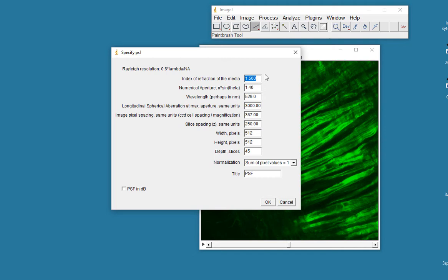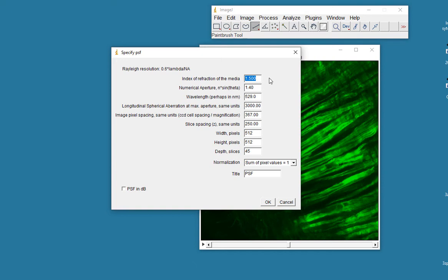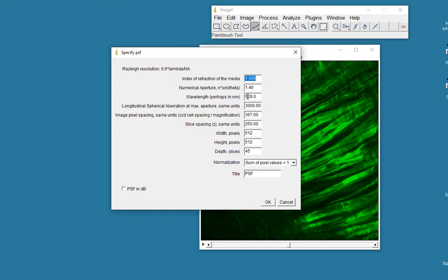It asks me for some information, and this is already populated from the previous time I've used this filter, which was a run through of this. So the index of refraction of the media, so did you use oil, did you use water, did you use air? My refraction, the refractive index of my media that I used, was 1.5. The numerical aperture of the objective that I used, I'm just guessing actually I think it was 1.4, seems about right for a 40x or 60x objective, I think this was a 40x objective.